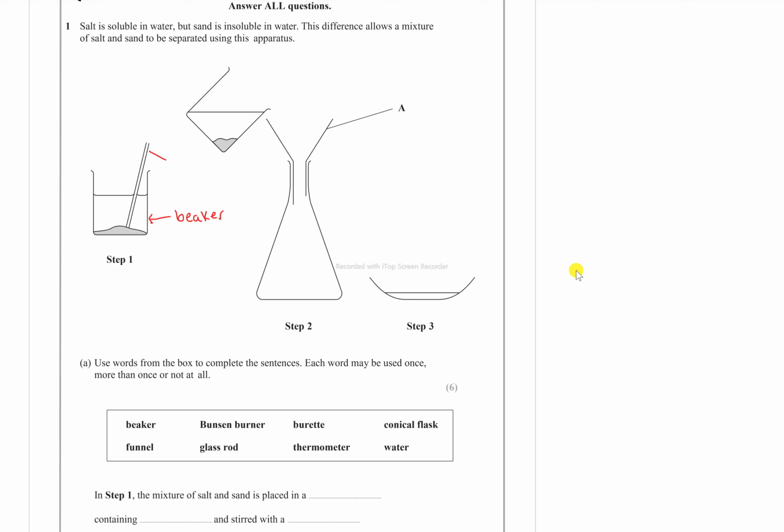That there is your glass rod. Right, you've got your funnel there. You've got your conical flask.